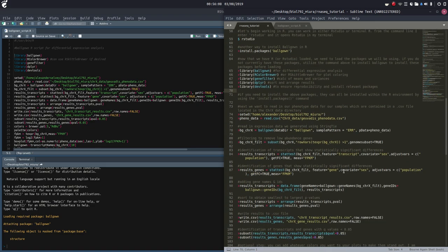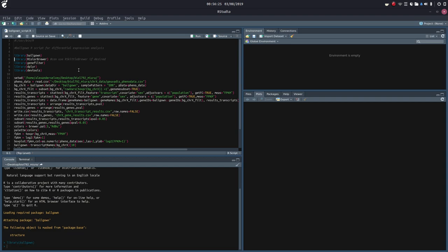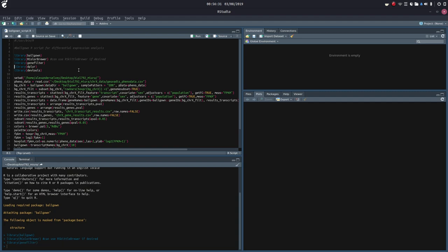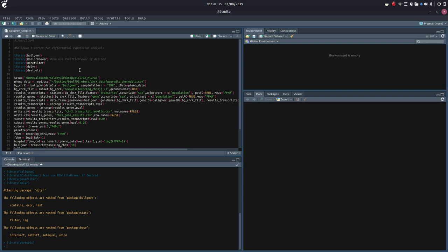So if you need to install any of the above packages, they can be installed using the install.packages command. Now, after we load our packages, let's load these up real quick. I'm just going to hit Control+Enter on each line of script.